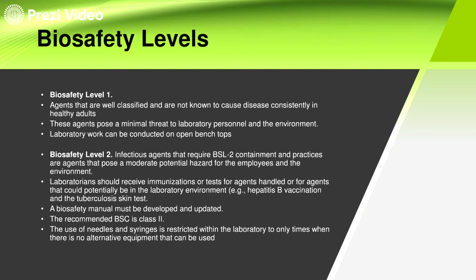Kaya nga meron ka tinatawag na biosafety manual dyan. And of course, you have the biosafety cabinet, which is the class 2. Ang meron tayo sa school is the class 2 biosafety cabinet. So, pwede tayo mag-handle ng biosafety level 2 microorganism. And also, the use of needle and syringes is restricted within the lab to only times when there is no alternative equipment to be used. So, bawal ang mga needle, syringes sa biosafety level 2. Hindi siya usually ginagamit.